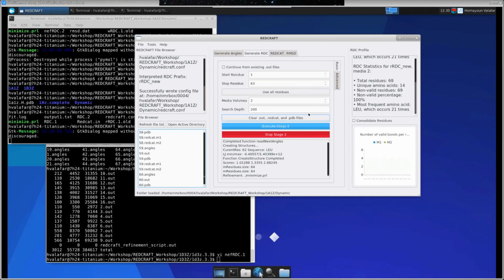By exchange, I presume chemical exchange, which implies that you're at some sort of observable time scale, and your structure is existing in two potential states. Correct. Yeah, that's right. A part of it. Let's say like a localized vibration, or libration, or motion, or something. Right. So it depends on how that reflects itself on your spectra.